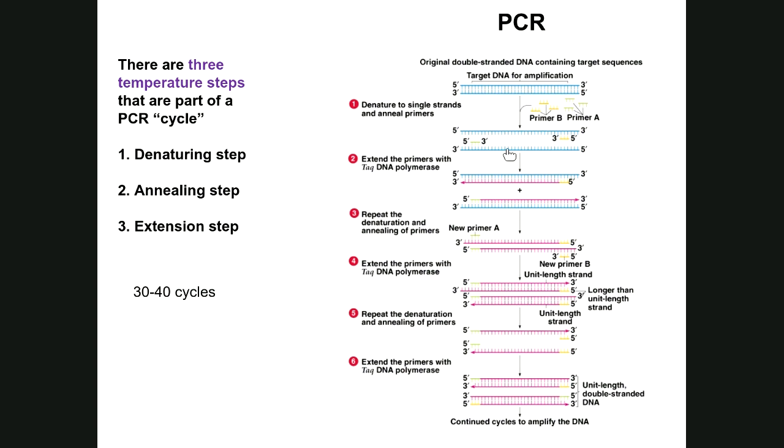In other words, the denaturation step breaks the hydrogen bonds holding the 2 DNA strands together.